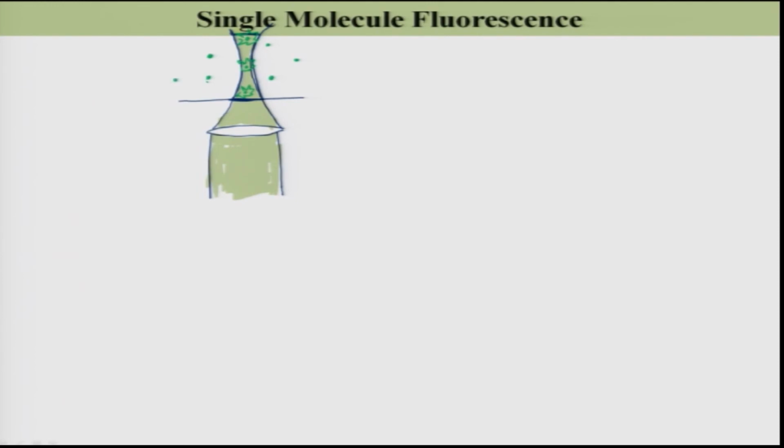So, in this case, you are going to see the fluorescence from the entire region, and obviously that means your observation volume is really large. If you now decrease the concentration of the molecule in the sample but your observation volume is large, your background Raman scattering will be much more. So, your aim is not fulfilled. That aim is to create a small observation volume.